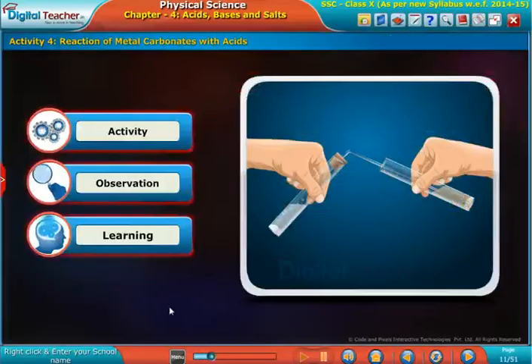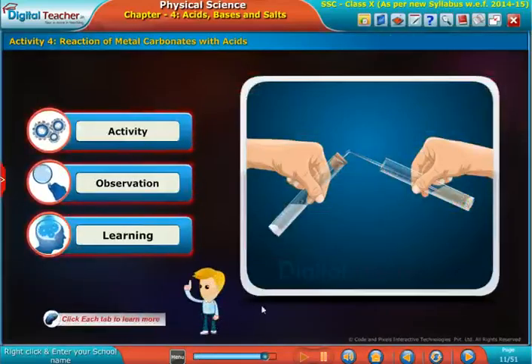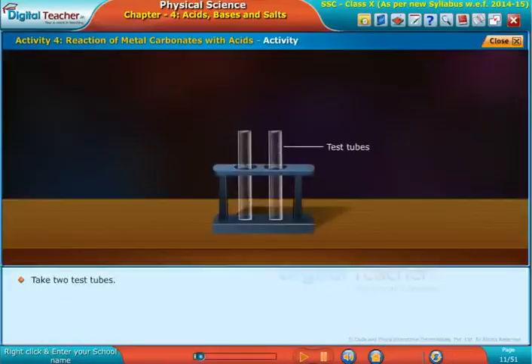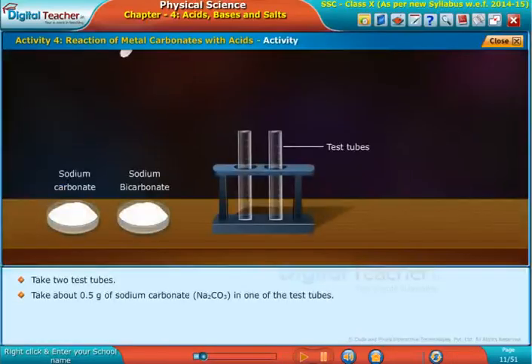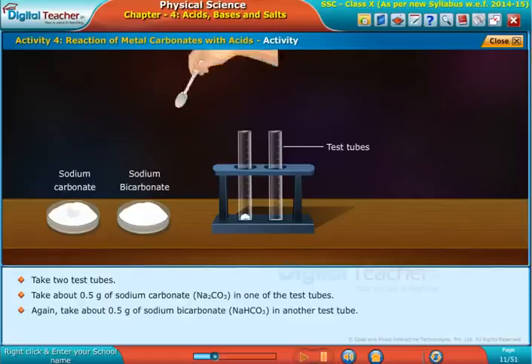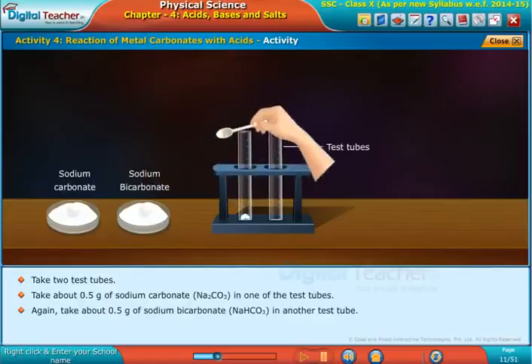Take two test tubes. Take about 0.5 grams of sodium carbonate (Na2CO3) in one test tube. Again, take about 0.5 grams of sodium bicarbonate (NaHCO3) in another test tube.